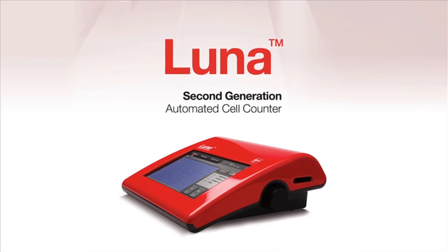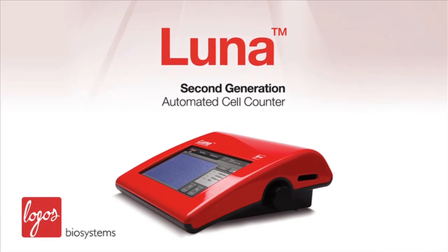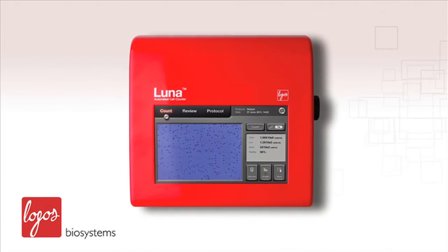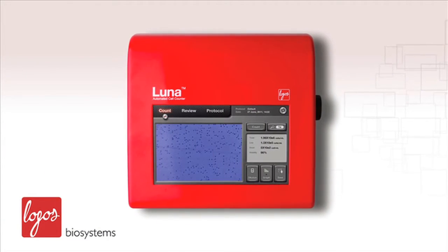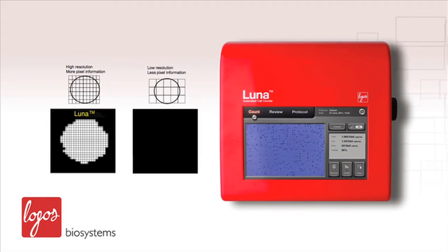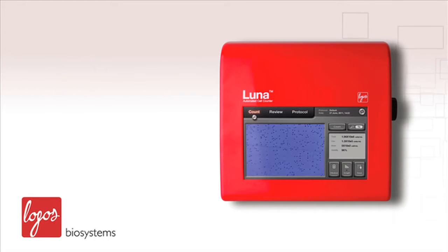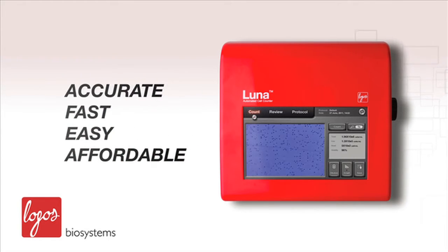Introducing the LUNA, the all-new second-generation automated cell counter from Logos Biosystems. The LUNA is an automated cell counter that accurately measures cell number and viability for various purposes. It incorporates many innovations introduced by Logos Biosystems and provides you with an accurate, fast, easy, and affordable cell counting experience.